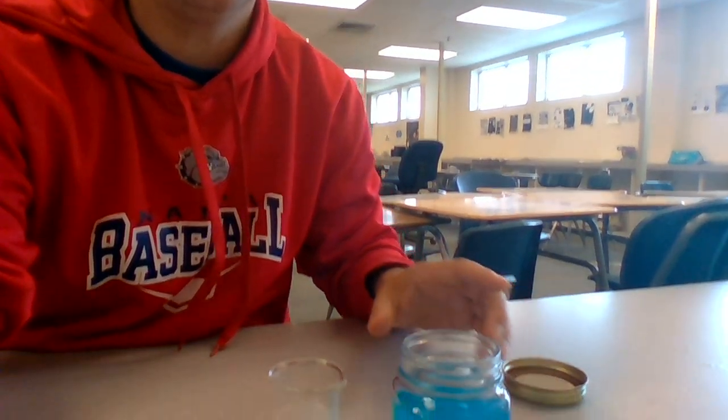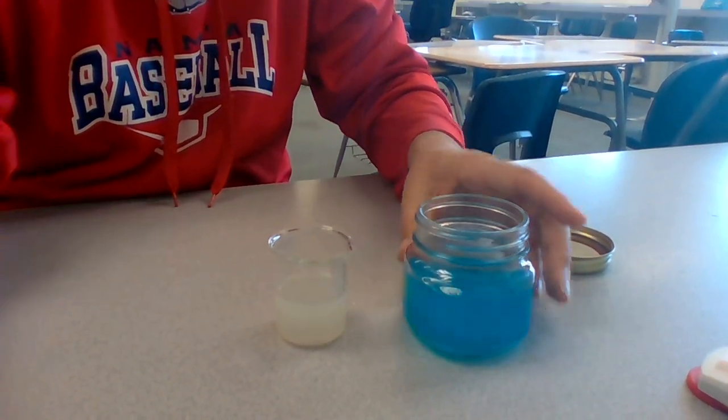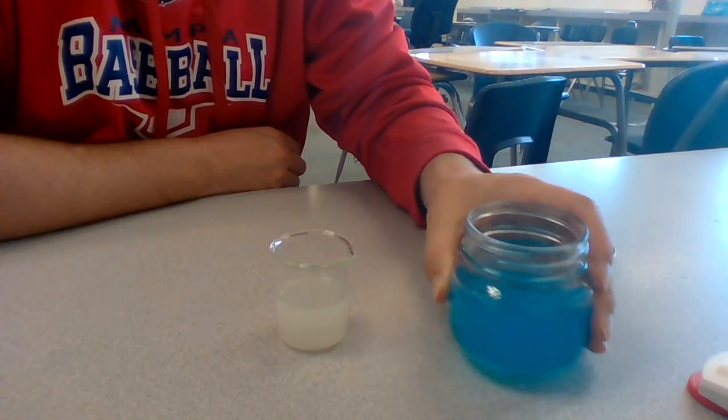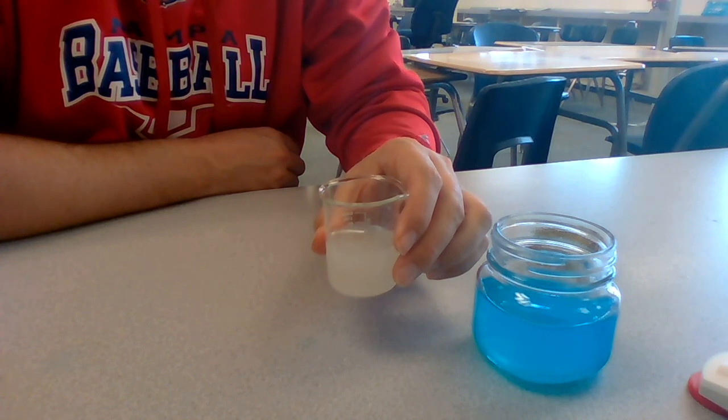All right, this is Mr. Hedrick, and today we are going to do the reaction of silver nitrate and copper chloride. It says to take a peek at each one of these individually, so I'm going to scroll down here so that you can see. This is our copper chloride, and this is our silver nitrate.